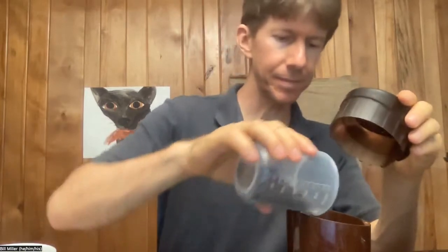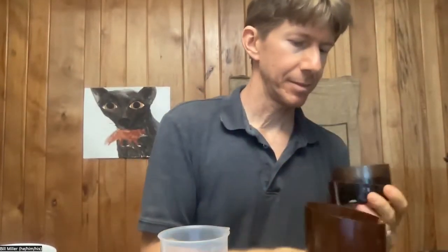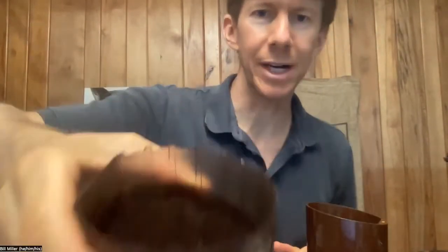I am going to grind it up for 10 seconds in my grinder. Counting: 1001, 1002, 1003, 1004, 1005, 1006, 1007, 1008, 1009, 1010 — and I should be shaking it. Hopefully that looks pretty good. I got it pretty fine.